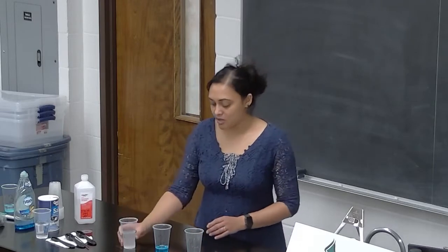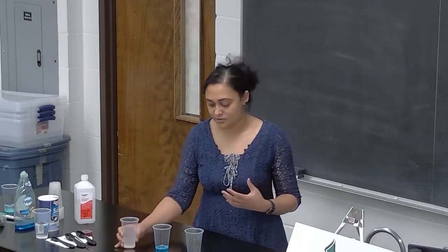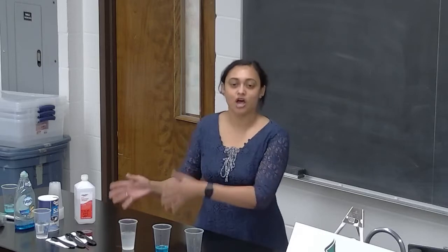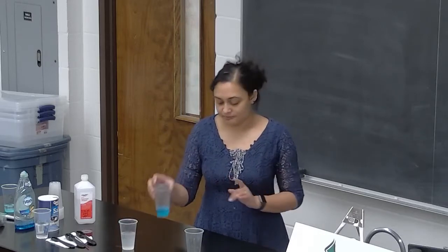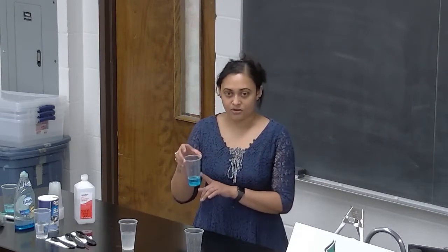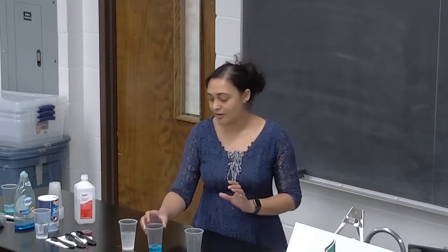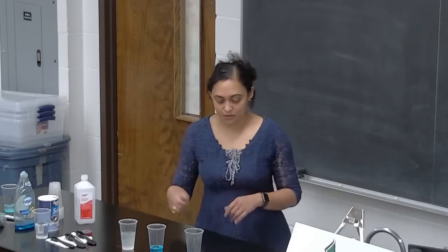Now this is a common solution that we are going to use to extract DNA. So this can be used by multiple students. It can be a stock solution. We can do the same for the soap water as well. Each student can have their own soap water, or there can be a common stock of soap water where you can take 1 scoop or 1 tablespoon out.